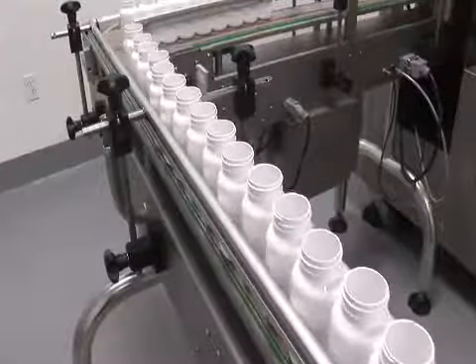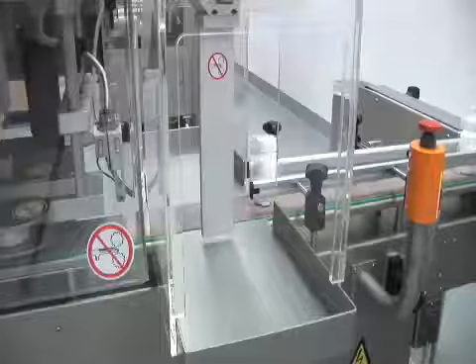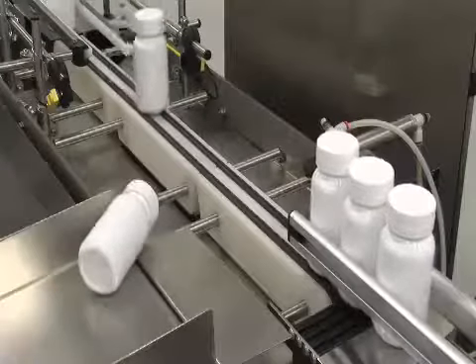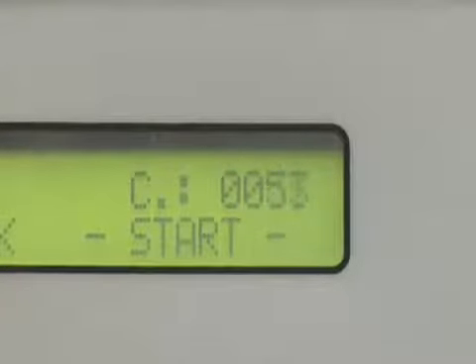Bottling of capsules is a high-speed automatic process that includes several points of quality assurance. Sensitive products get a moisture-absorbing pouch inserted into the bottle. The capping station automatically rejects improperly capped bottles. The capsule counting station has a reject system for any bottle that is underfilled, but as an added safeguard, we set counters at +1. A bottle that is supposed to have 60 capsules is filled with 61.